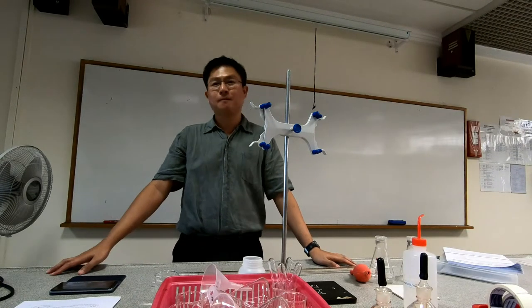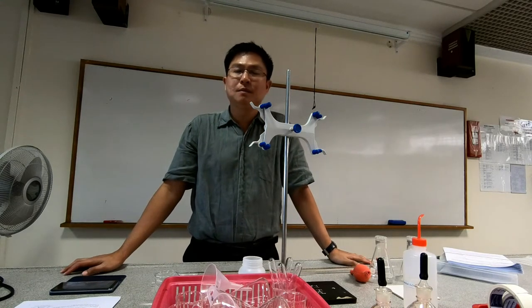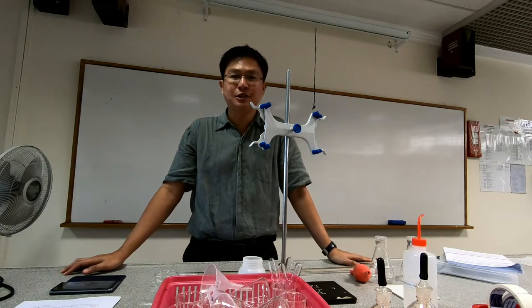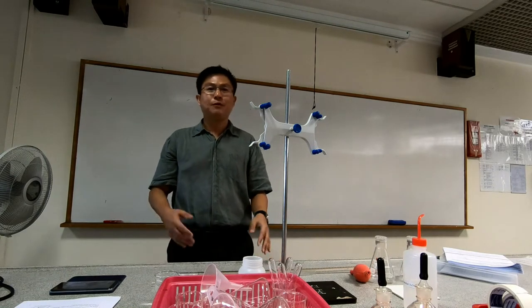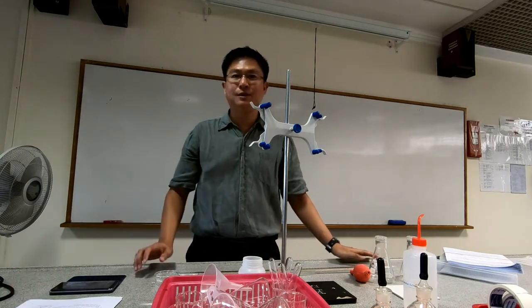Welcome to your first practical lesson in CH301. In this first practical lesson, we shall learn how to do a simple titration. Before I proceed any further, let's just refer to the handout that's been given to you.